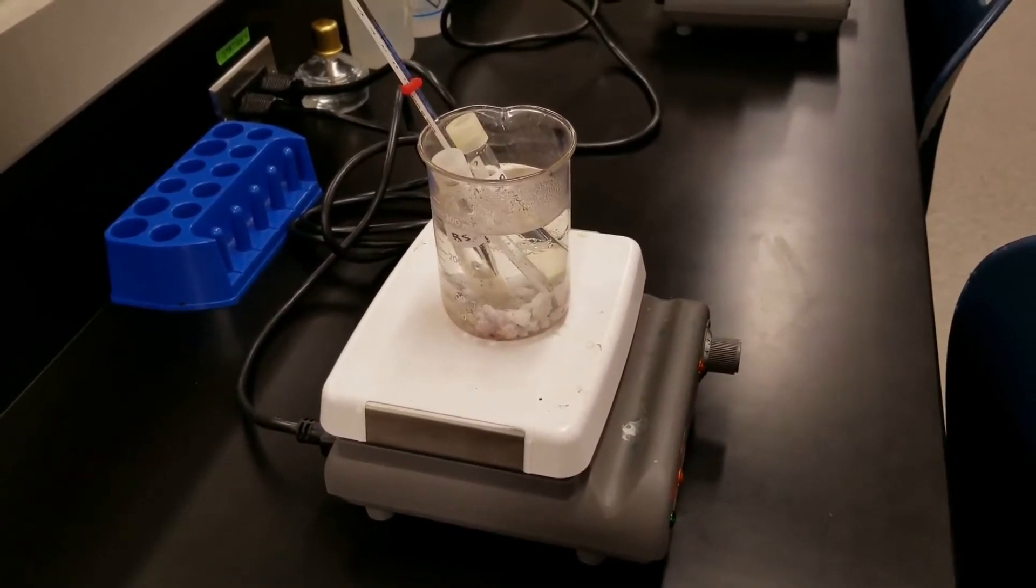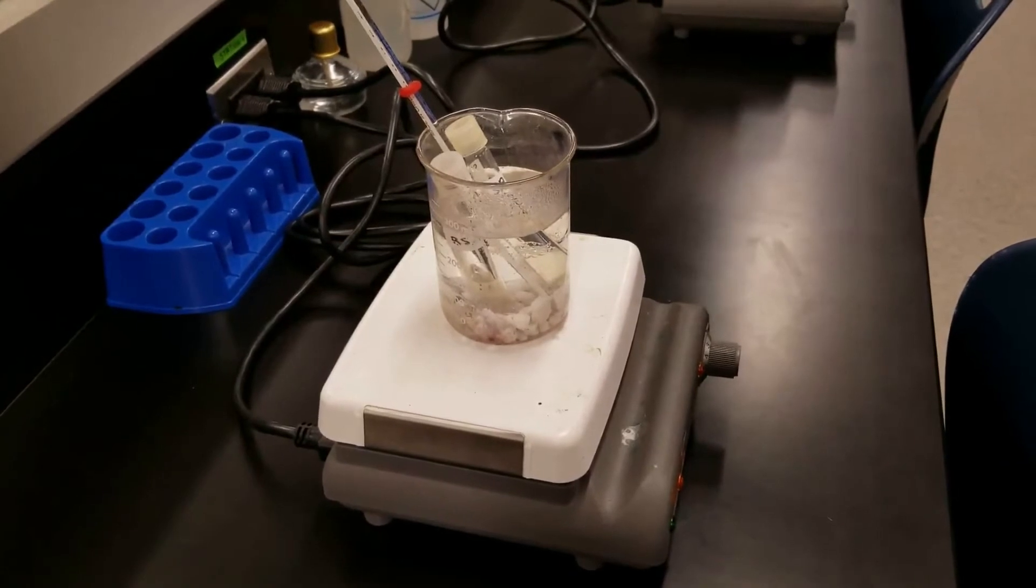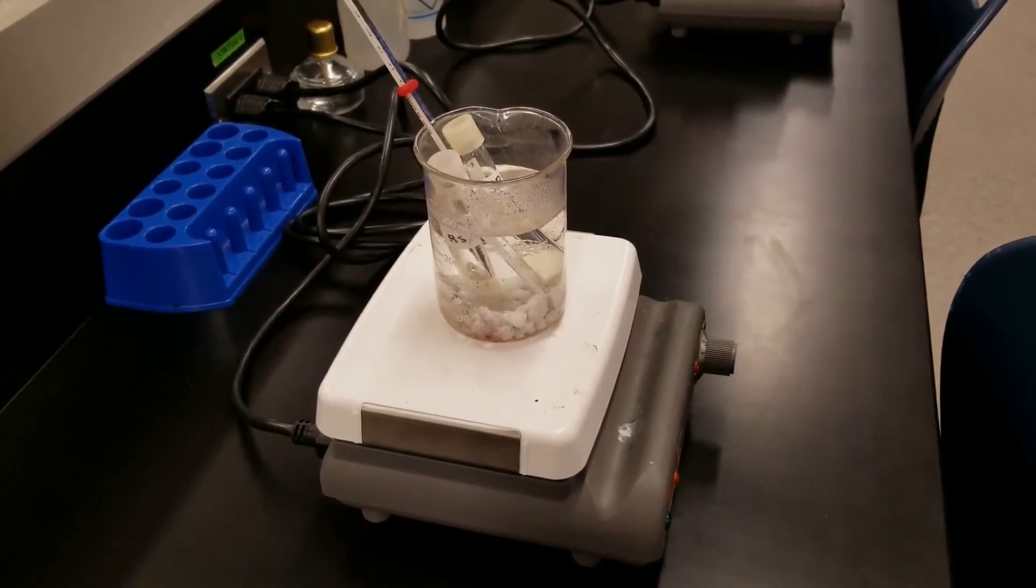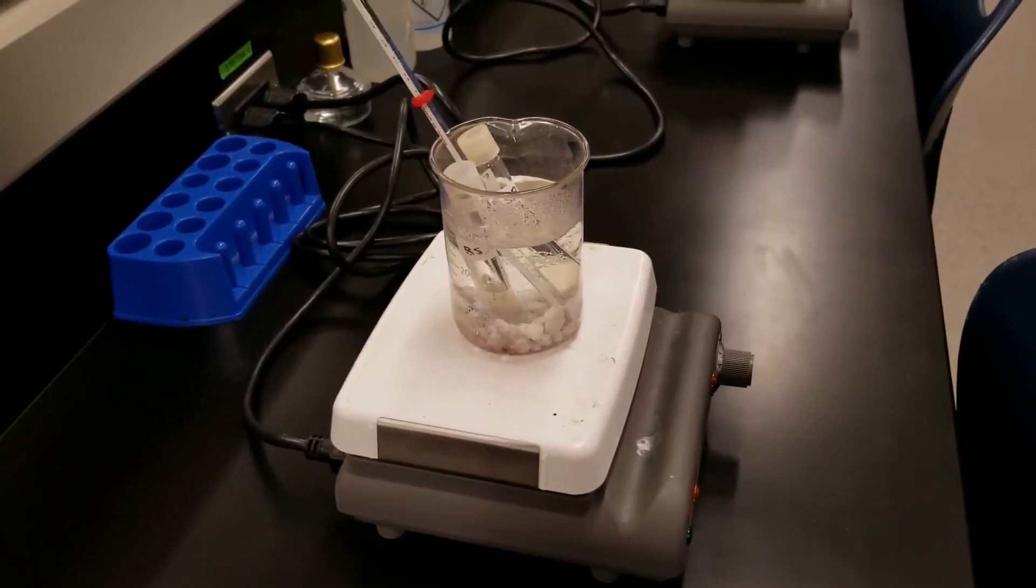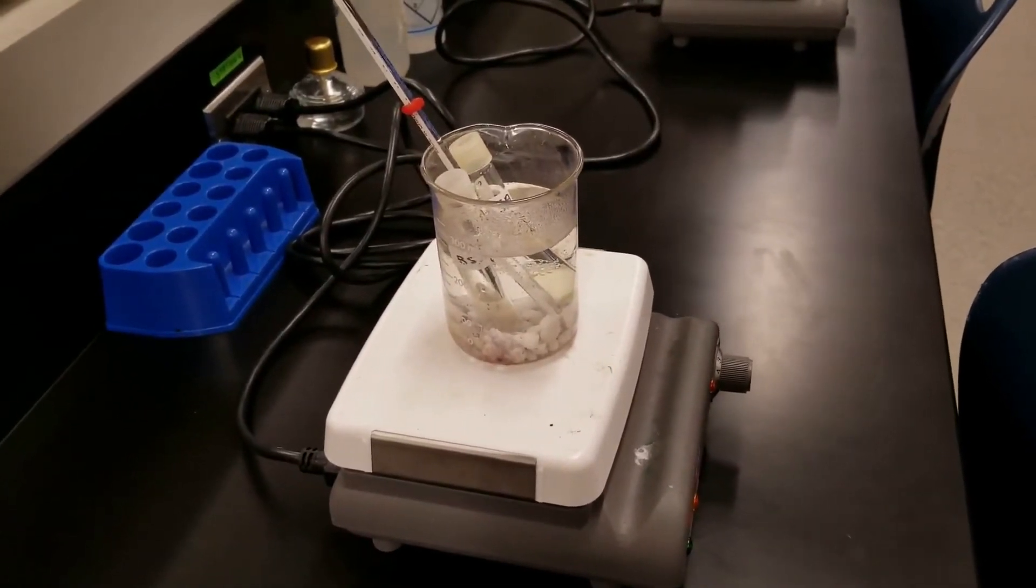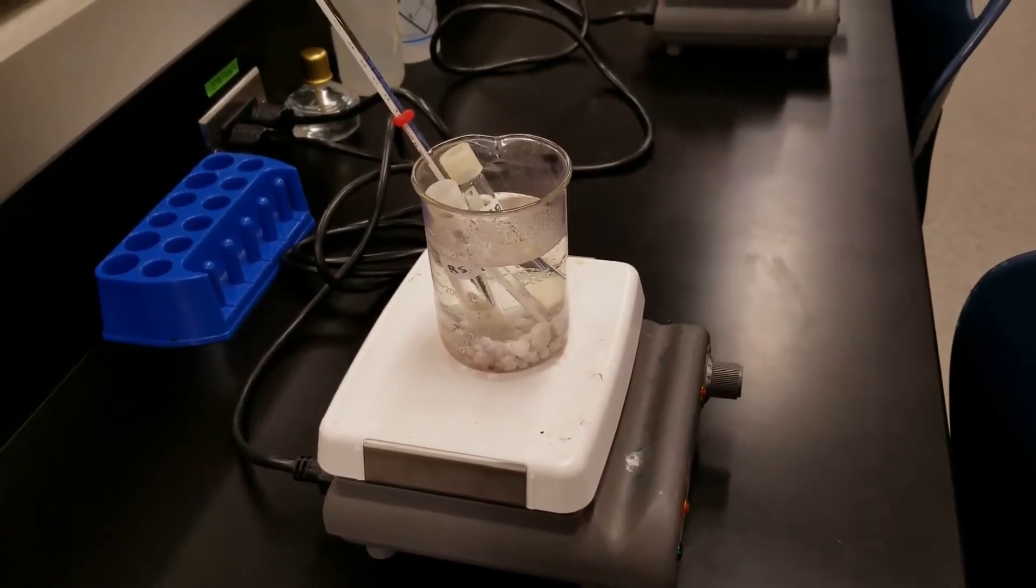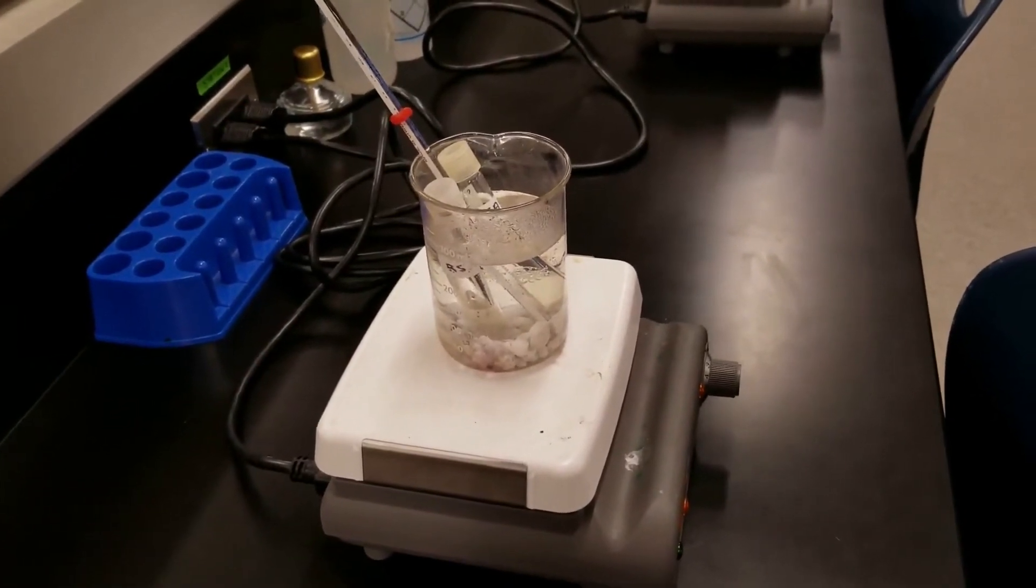At each of those temperatures, we will time it for 10 minutes, and then afterwards streak it on a plate. All the plates will be incubated at 37 degrees Celsius, and tomorrow we will look at it and see whether we had good growth, poor growth, or no growth, to see what the effect of the temperature is.